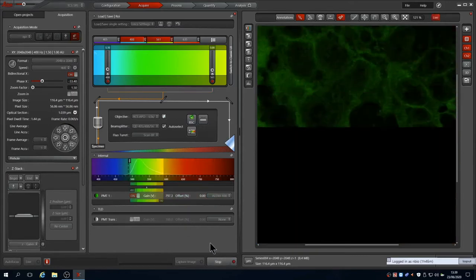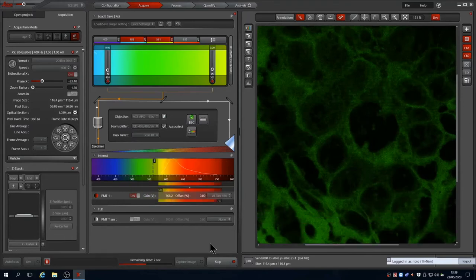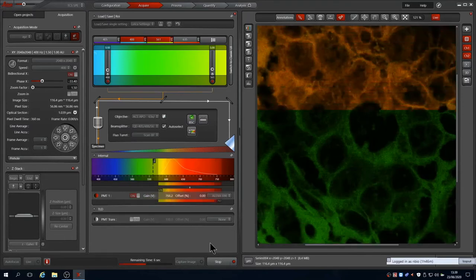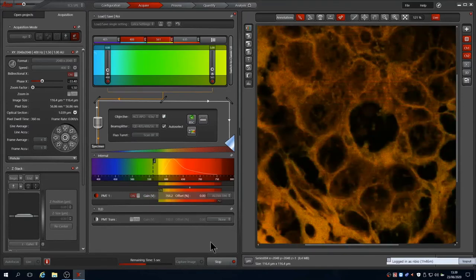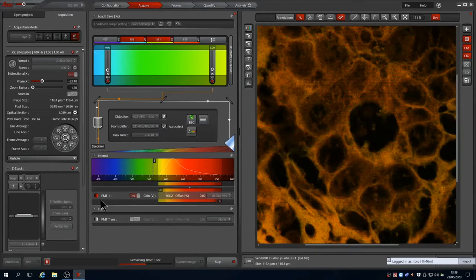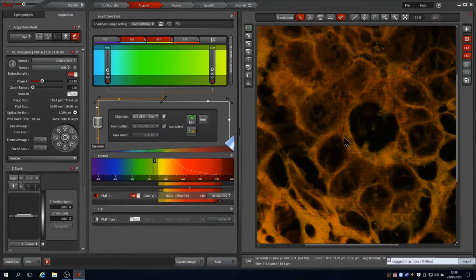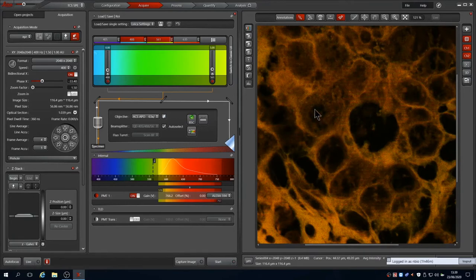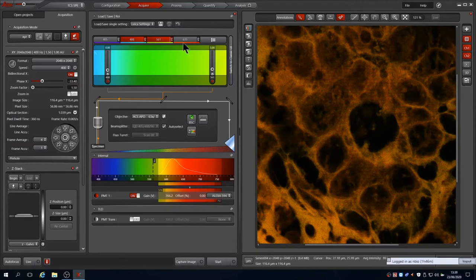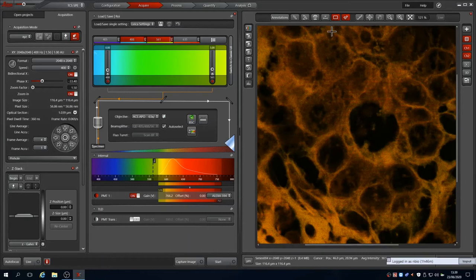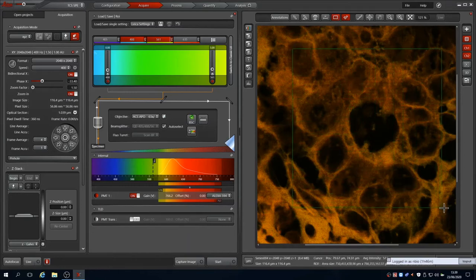Obviously this is increasing the time our scan takes as well as adding more light to the sample. The software applies these settings separately to each sequential scan, so a dimmer channel can be scanned slower and with more averaging than the bright one for example. We can decrease the scan time if we only image the area of the field we're interested in. Switching zoom in on selects a rectangle for us, and we can use this to draw the area where we'd like to image.